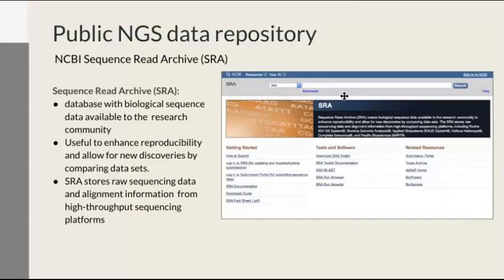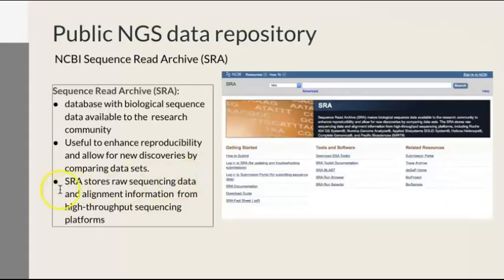You can find everything from raw sequence files, such as the actual FASTQ file, but you can also find files that have already been aligned and have some processing. For example, previously we worked with that ChIP file, and if you recall, I said that this ChIP file was an output of the MACS peak calling. So they've already aligned it, they've already called the peaks for where they think they see the enrichment of the ChIP sequencing, so you can get data that already has some processing done to it, or you can actually pull raw sequences.